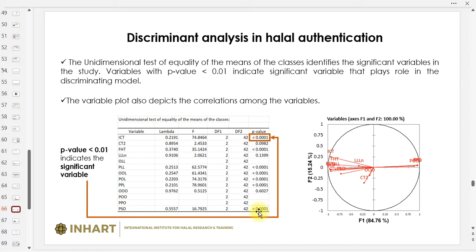But we cannot achieve this 10 before we carry out a higher number of fatty acid analyses, and then using discriminant analysis, it will propose to you which are the significant variables. Okay, this is understood. Besides that, we will look later at similar plotting in principal component analysis related to the correlation. So you can see we have 1, 2, 3, 4, 5, 6, 7, 8, 9, 10. Out of 10, only 7 are significant variables in our study.